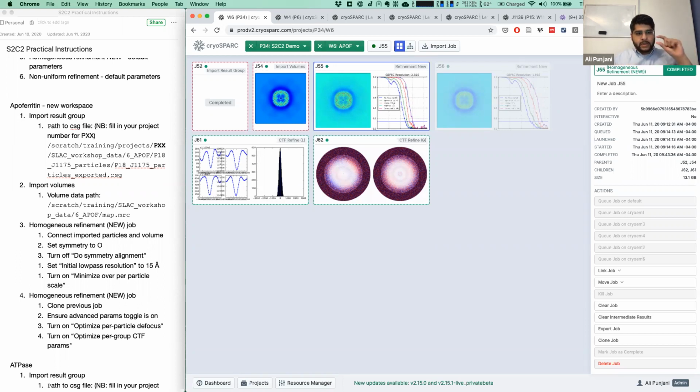So we are not considering the fact that the top of the particle and the bottom of the particle are at different defocus levels. That is something that could become important for very large particles, or in other cases like lower energy microscopes, but at 300 keV, for the kind of standard size of particles that most people are dealing with, it has not yet been shown, except at extremely high resolutions, to be an important factor.